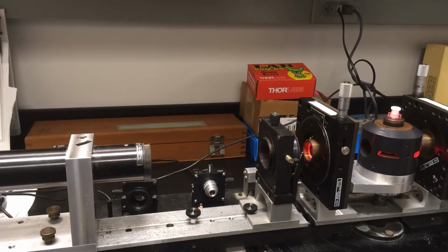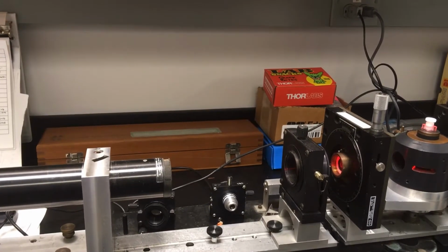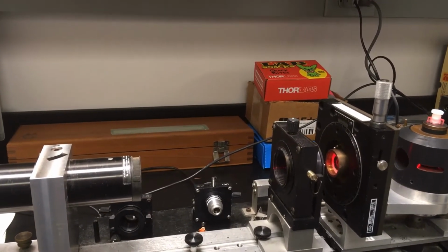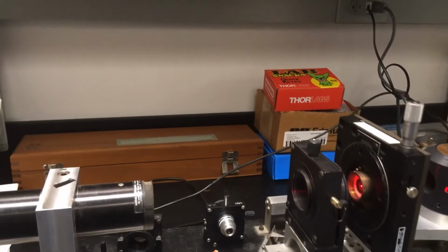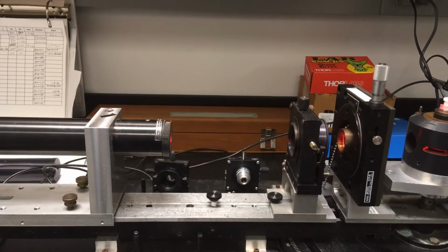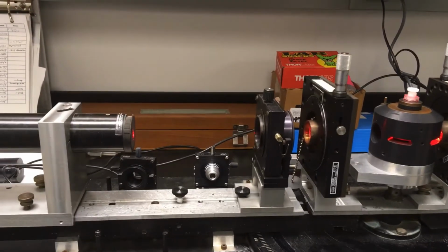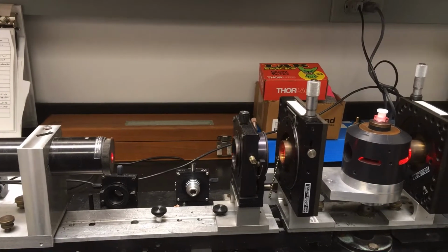and you can see them there. The little first thing after the laser that you see is a lens assembly, and that is aimed to the center. And then the next thing that you see, coming in the direction from left to right, is the vertical polarizer. Now, the laser is already vertically polarized, but it only has something like 100:1 polarization purity. So this polarizer that's after that is called a Nicol prism, and it cleans up the residual horizontal component, and now it is fully vertically polarized.